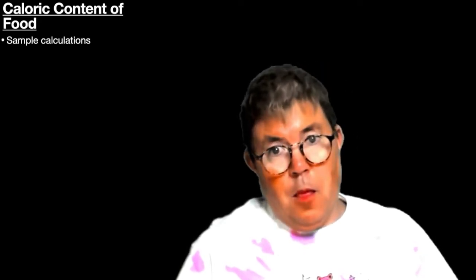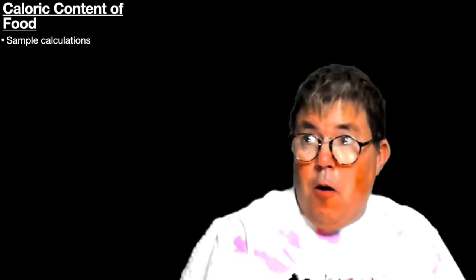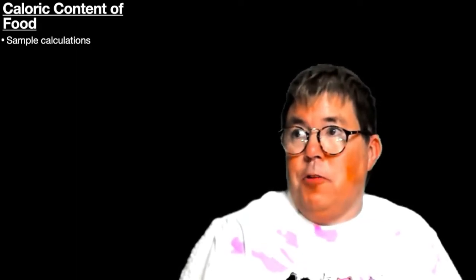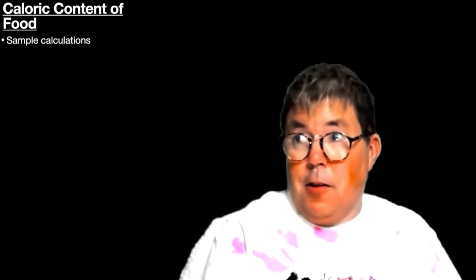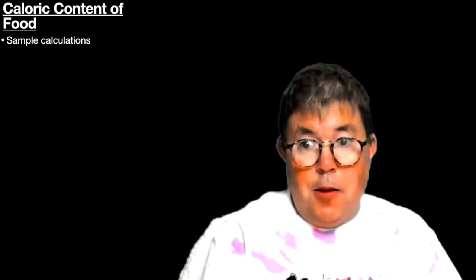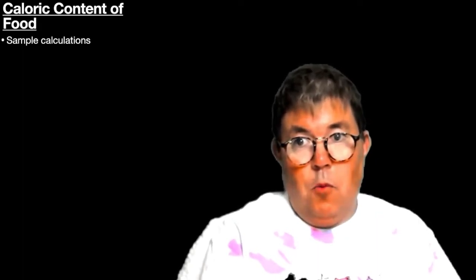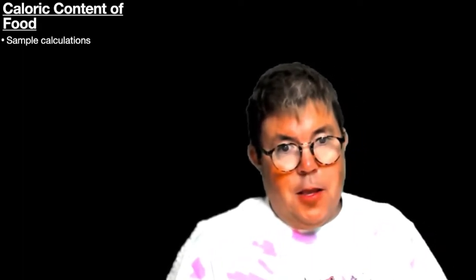This experiment is all about calculating the caloric content of food. I think the procedure online is very straightforward, so I am not going to spend that much detail or time discussing the procedure. What I want to do is to go over the calculations with everyone, because I believe most people collect the correct data, but we have problems when it comes to the calculations.